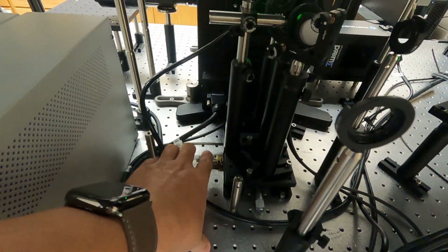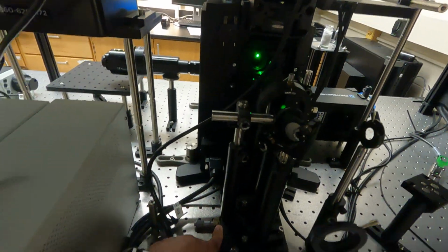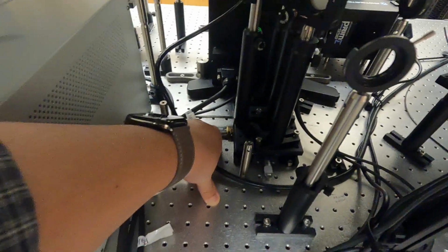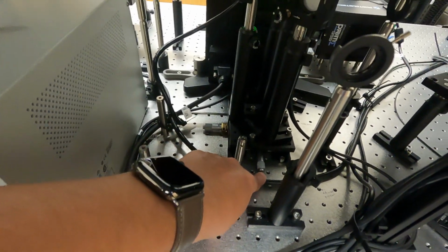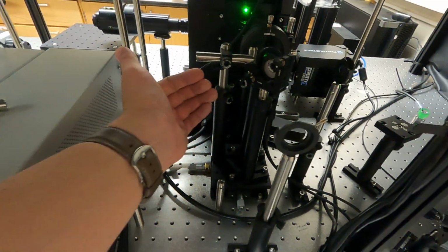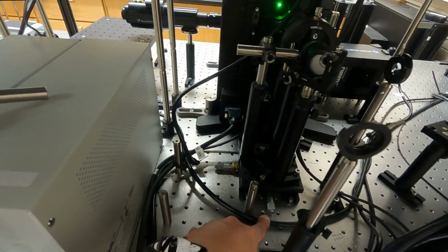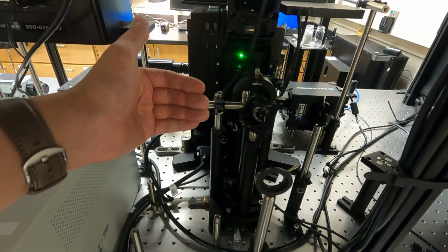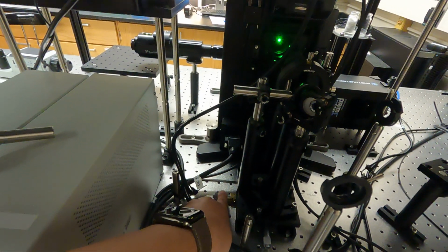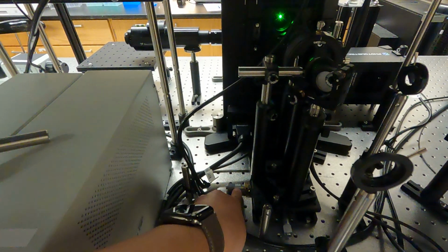This is an XY translation stage that controls the movement of this lens set, and this is the knob you can adjust. Do not ever touch the knob at the back of this translation stage. This controls the movement along this direction, and it has been carefully measured along this direction. So do not ever touch this knob. The only knob we'll be using to adjust the TIRF versus the epifluorescence mode will be this one.